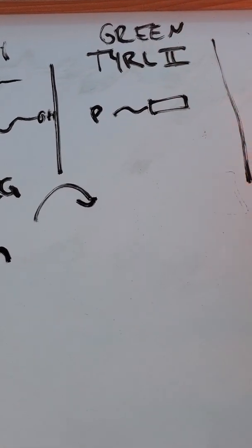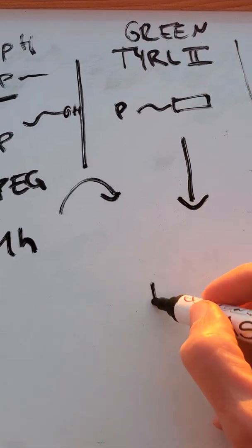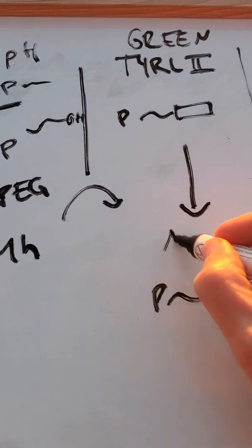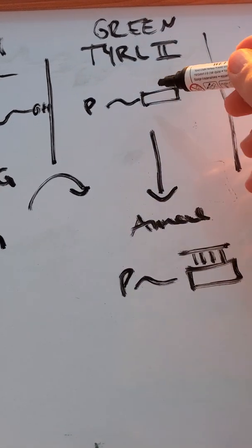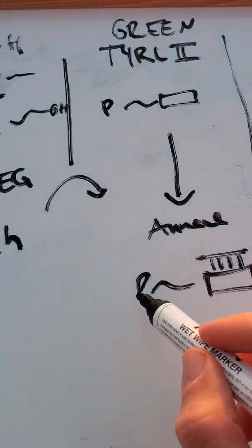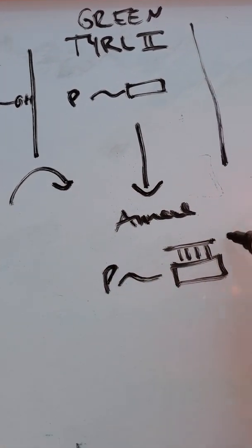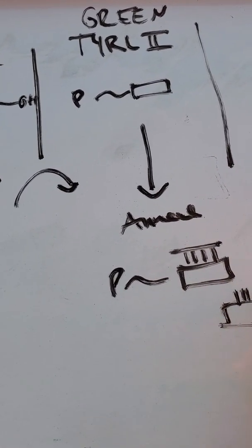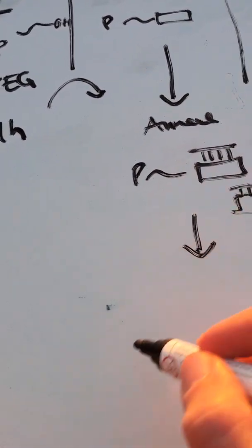Now, to avoid adapter dimers, because we still need to ligate on the 5' adapter, the next step we're going to do is we anneal a primer. And why do we anneal a primer? It's because T4 RNA ligase 1, which we use for the adapter ligation, likes single-stranded nucleic acids, but not double-stranded. And by making it double-stranded, we basically block all the adapter, the bound one, but also the unbound one, from adapter ligation. Once this is annealed, as the next step, we can add on the 5' adapter.